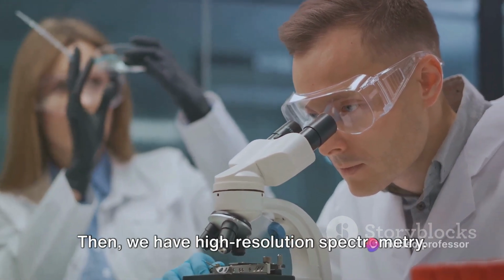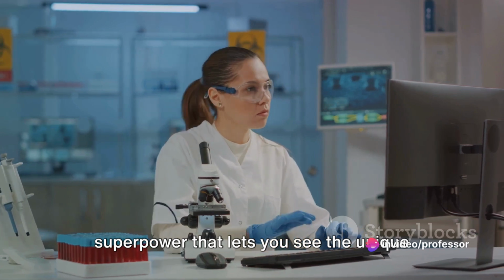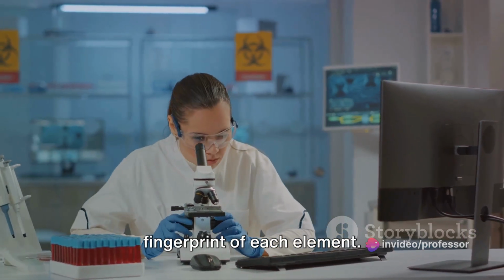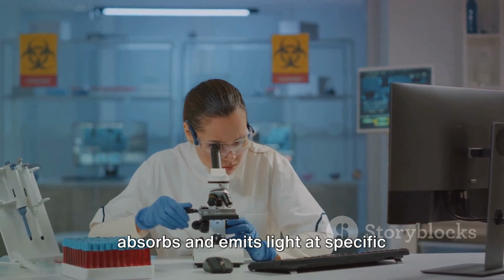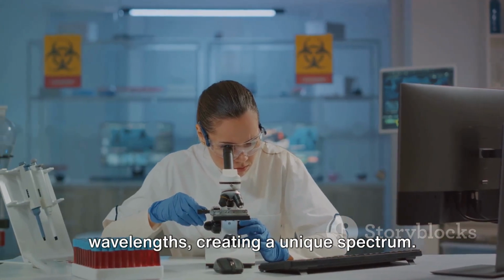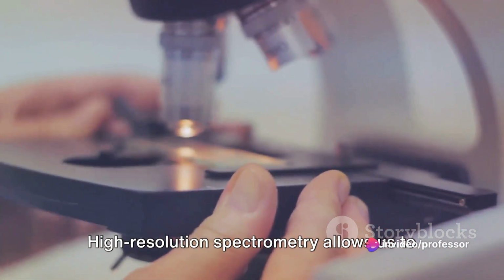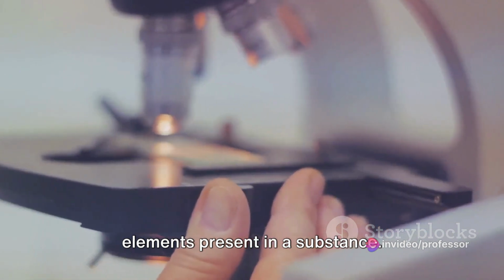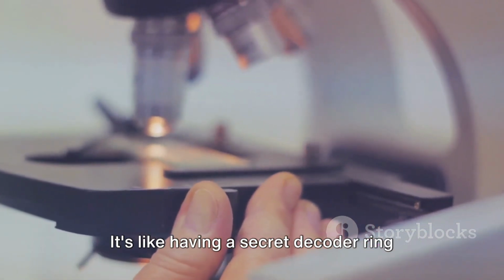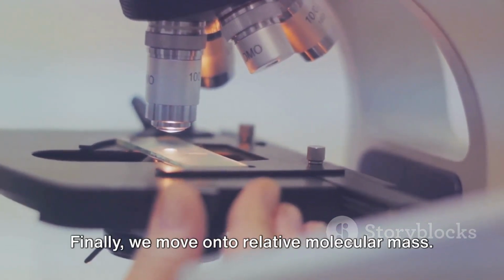Then we have high-resolution spectrometry. This technique is like having a superpower that lets you see the unique fingerprint of each element. Every element in the periodic table absorbs and emits light at specific wavelengths, creating a unique spectrum. High-resolution spectrometry allows us to observe this spectrum and identify the elements present in a substance. It's like having a secret decoder ring that can translate light into the language of elements.